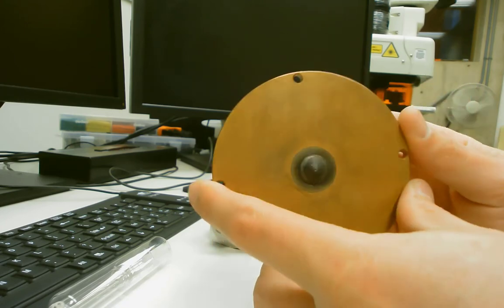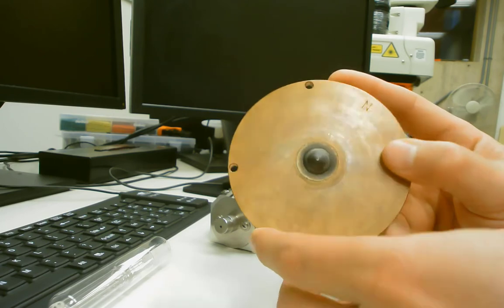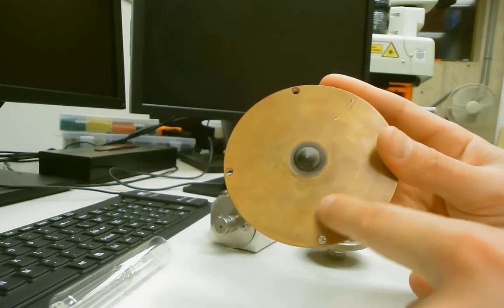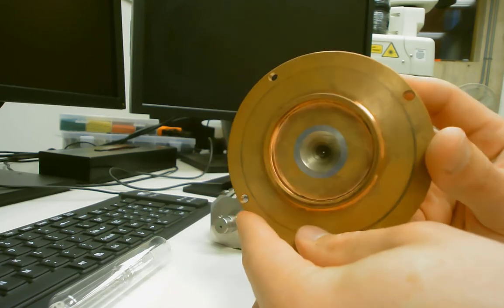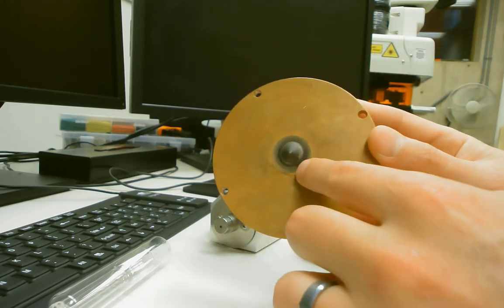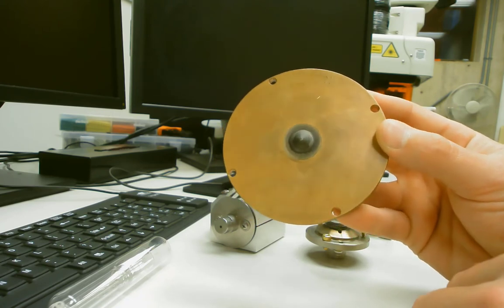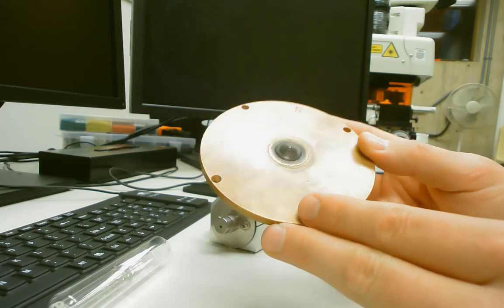So this definitely looks tarnished because it's old and has been handled a lot. But this part here is all copper, so it's solid copper. It's normally pretty shiny on newer cones. And then the part in the middle here is nickel, and nickel can handle really high temperatures, so it's a good choice for this.